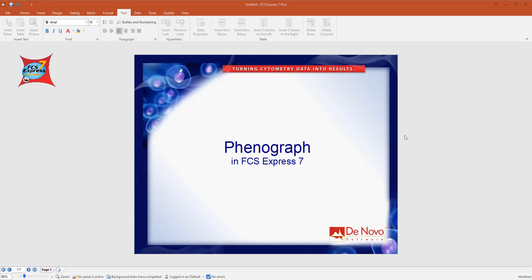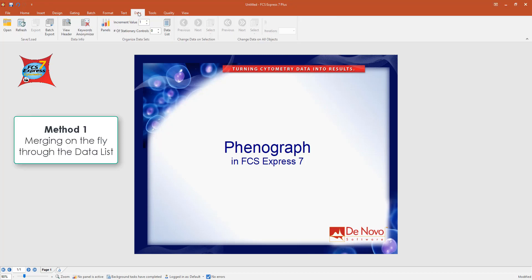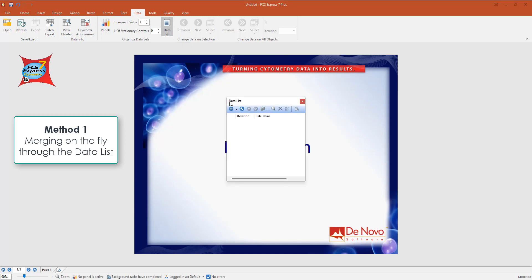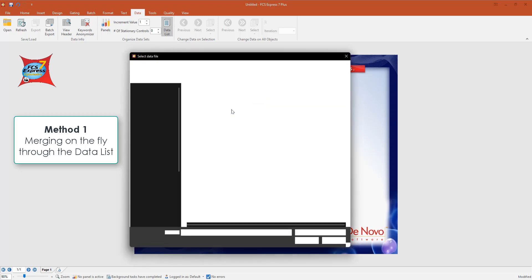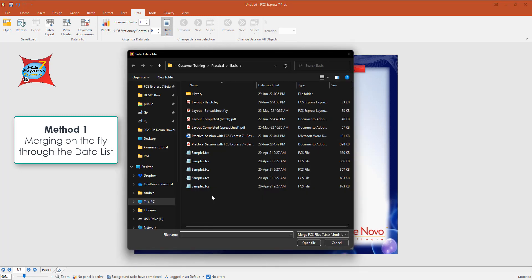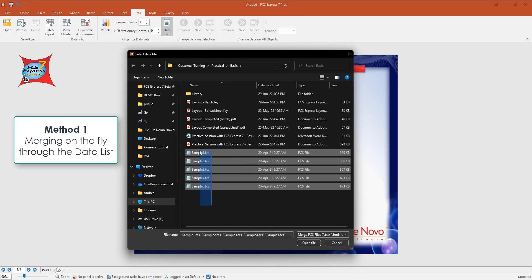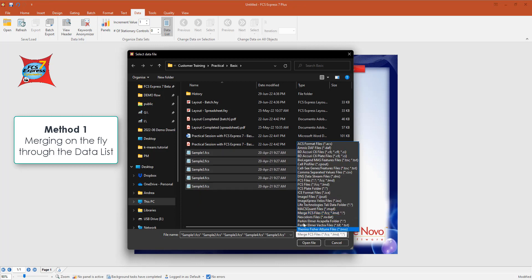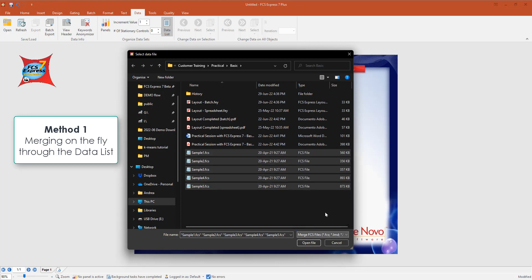First thing you might want to do when dealing with high dimensional data analysis tools, such as Phenograph, is loading data as a merge file. In FCS Express there are a couple of ways you can do this. I'm going to use the merging on the fly, so just go to data, open the data list, and then select the files that you want to merge all together and select merge FCS file as file type.